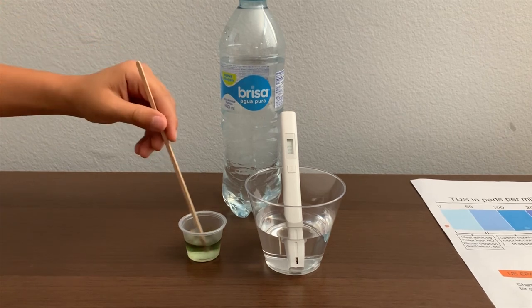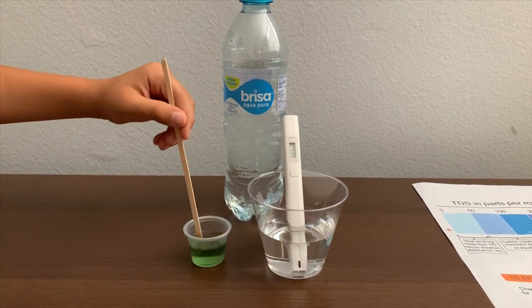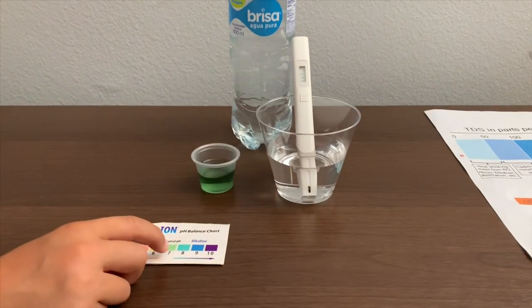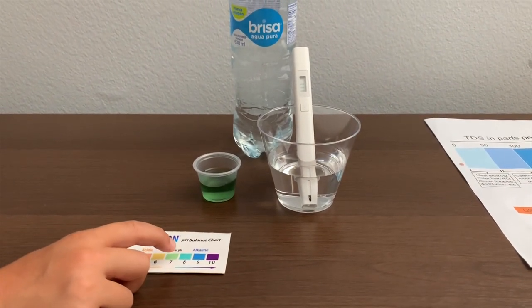Let's stir it a little for a better result. I give this a 7.5. This is alkaline water.